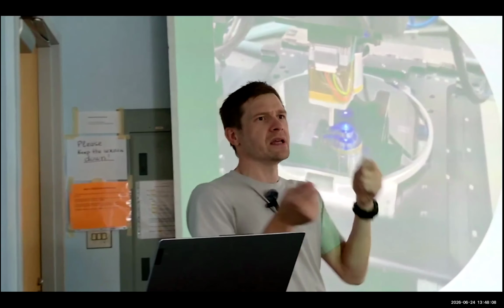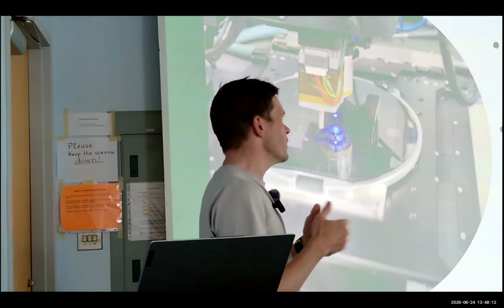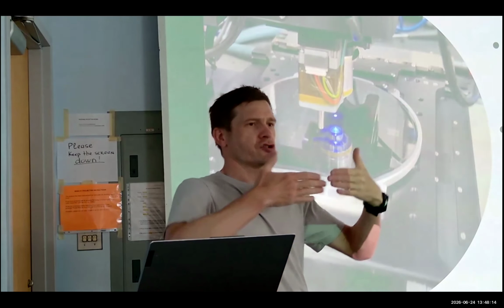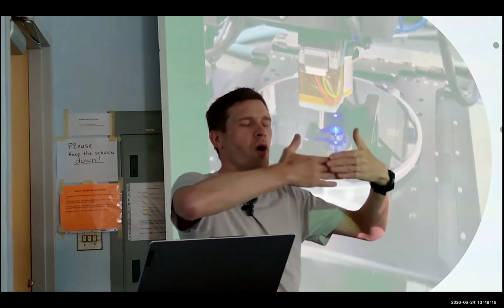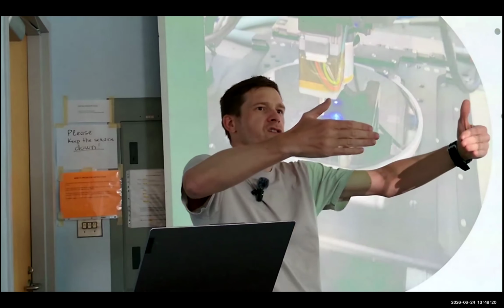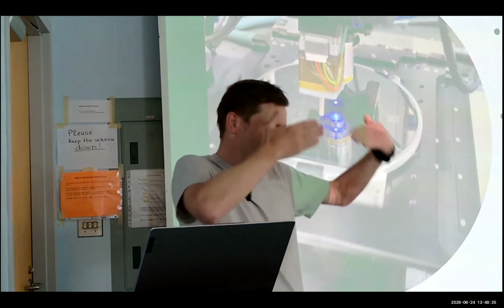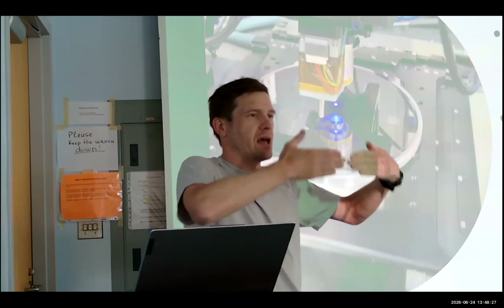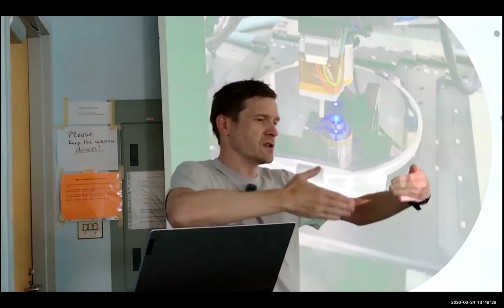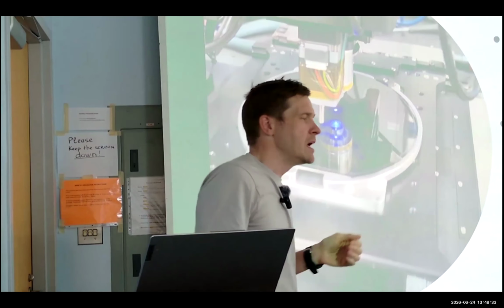The technology that's really enabled this is TDI. Traditionally, line scan cameras were one line of pixels, and you would sweep them across your sample, and every 1 pixel of distance, you would read that 1 row of pixels out, and then move to the next one, building up your image 1 row of pixels at a time.